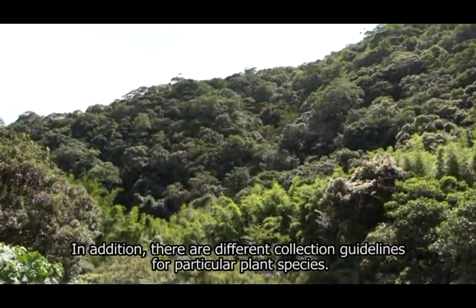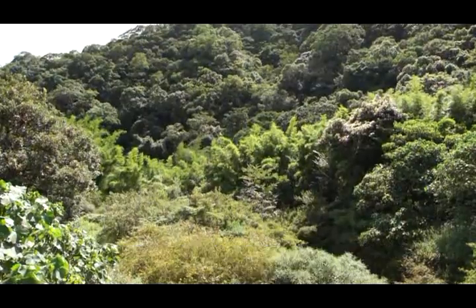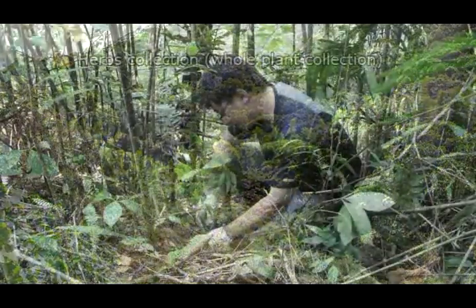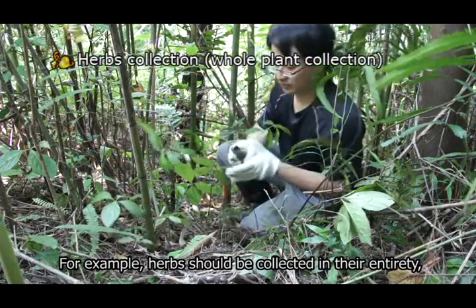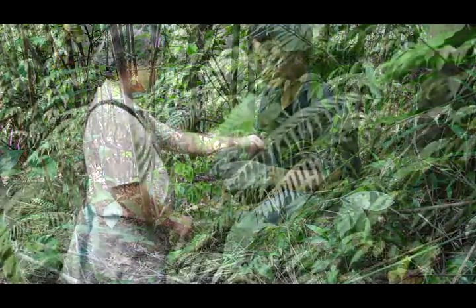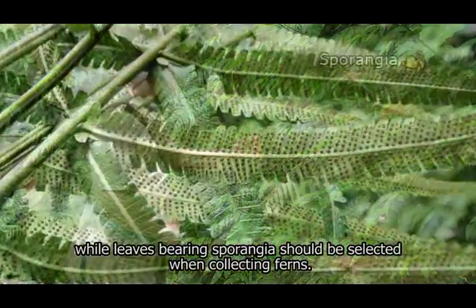In addition, there are different collection guidelines for particular plant species. For example, herbs should be collected in their entirety, while leaves bearing sporangia should be selected when collecting ferns.